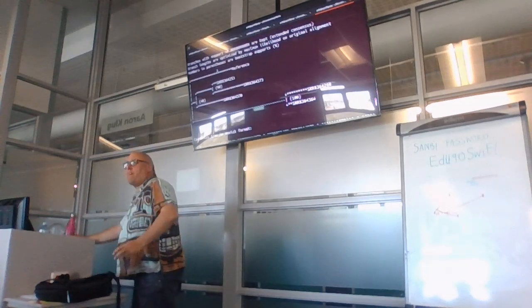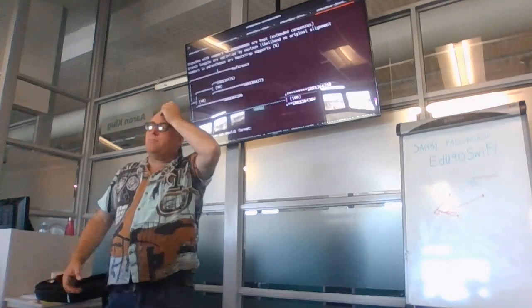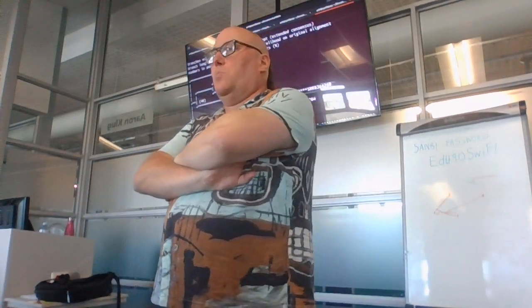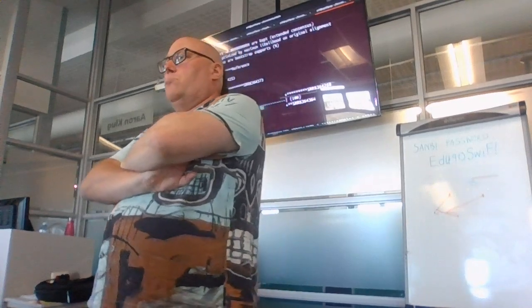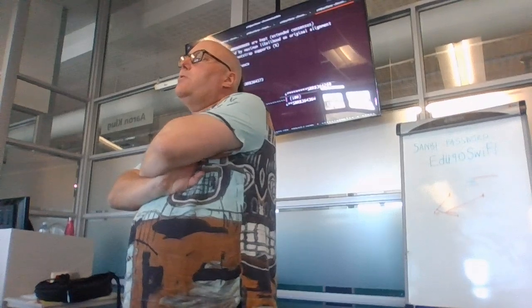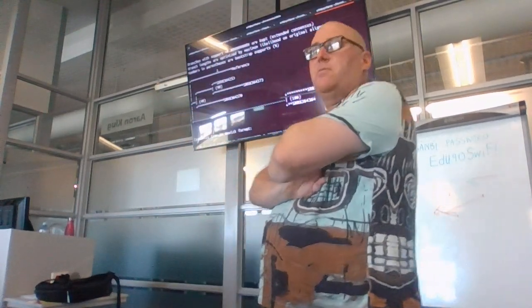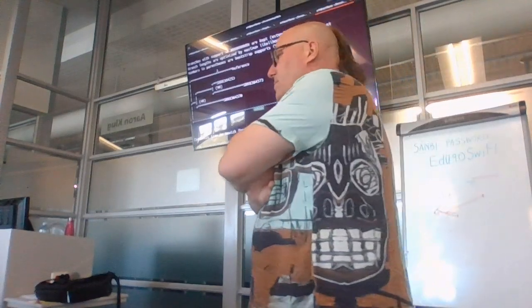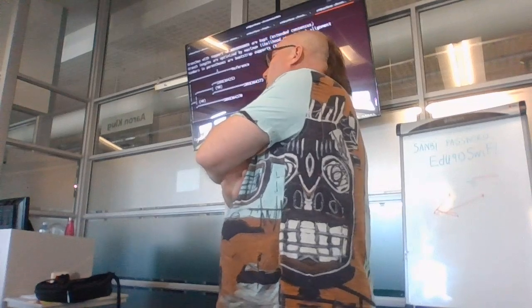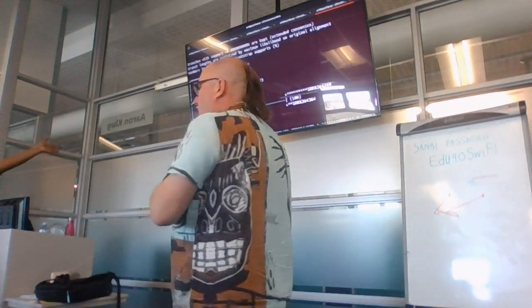Yes. If you change the reference, like you can look for another reference and use it, probably it could provide more information. But I don't think changing one sequence is going to be the trick here. The trick is make it more dense. Fill in the gaps. So if you change the reference to an older reference, do you think the topology of this tree will change?